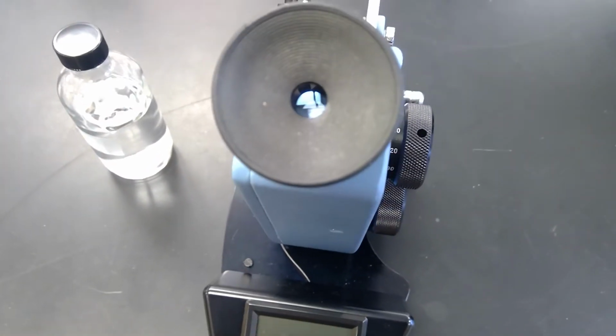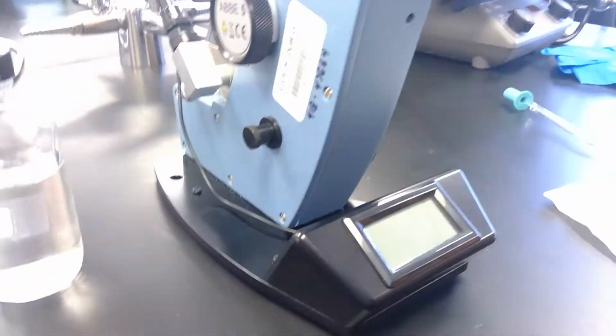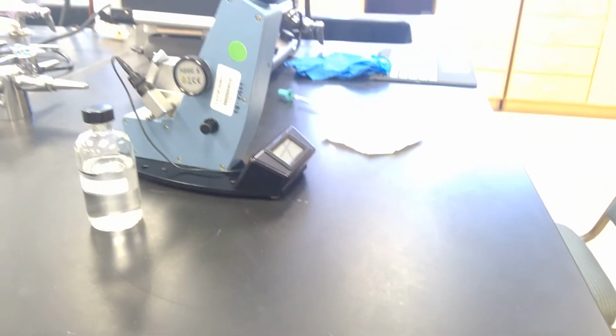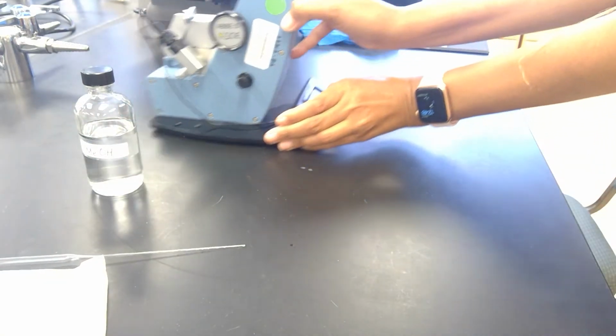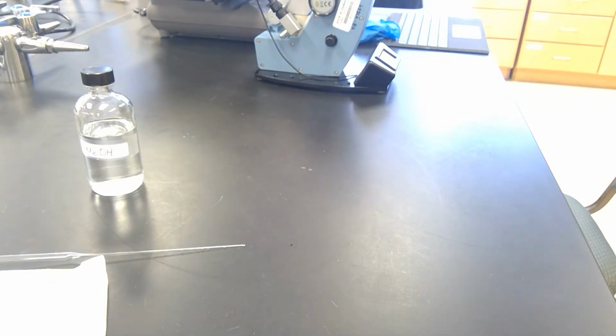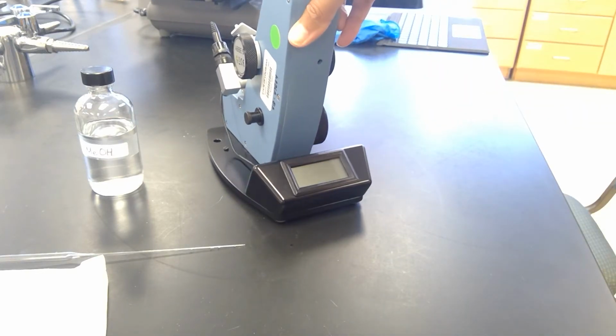So I know you guys can't really see on the inside, but in the lecture portion I'll show you what's going on. So I'll kind of move you up into the side so that you guys can see me. And I'll turn it so that you guys can see me do some of the adjustments.